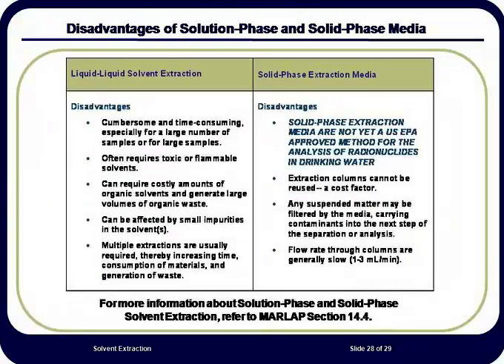One of the most significant disadvantages of SPSE for drinking water analysis is that these materials are not part of any EPA-approved method. Therefore, they cannot be used for drinking water analysis under 40 CFR. However, this will be changing in the near future.